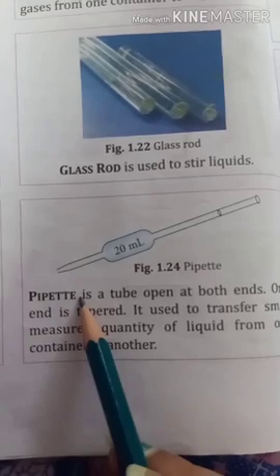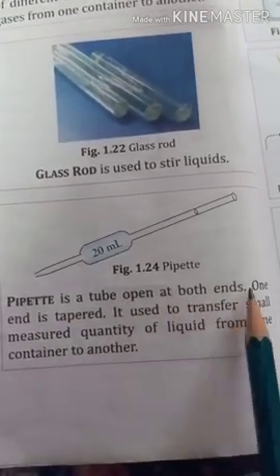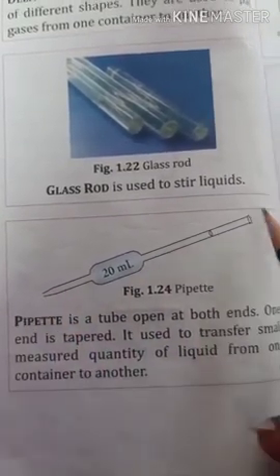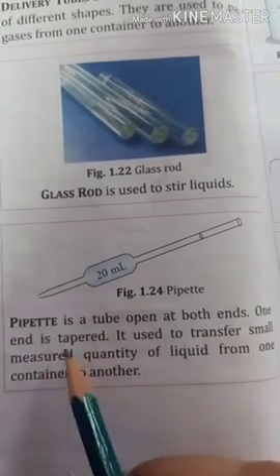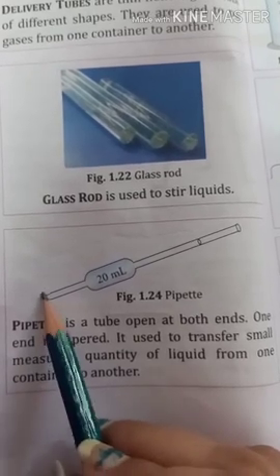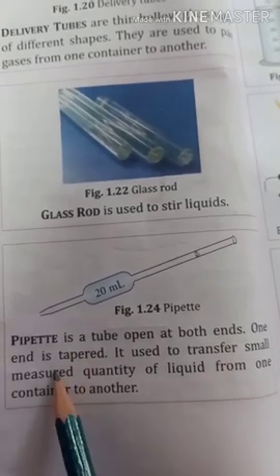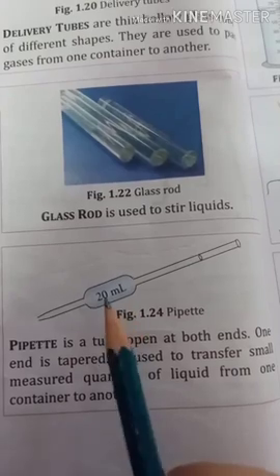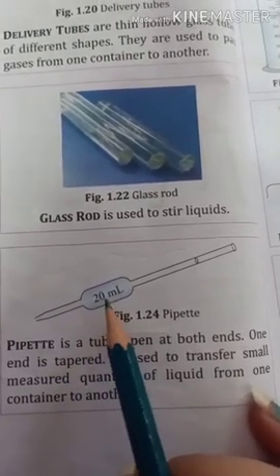Next is pipette. Pipette is a tube open at both ends. One end is tapered. Tapered means one end is less in thickness. So this end is tapered, and it is used to transfer a small quantity of liquid from one container to another container.